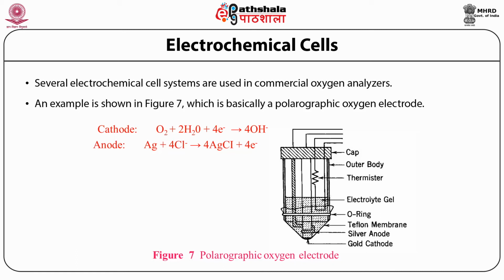Since the sensor consumes a small amount of oxygen and the diffusion of oxygen through liquid is relatively slow, a liquid sample must flow continually past the sensor for valid results to be obtained. With a static liquid sample, the oxygen supply would be gradually depleted. The device will cover the ranges 0 to 2.5 parts per million up to 0 to 100 ppm of dissolved oxygen, or 0 to 500 ppm up to 0 to 1 volume by volume of gaseous oxygen.